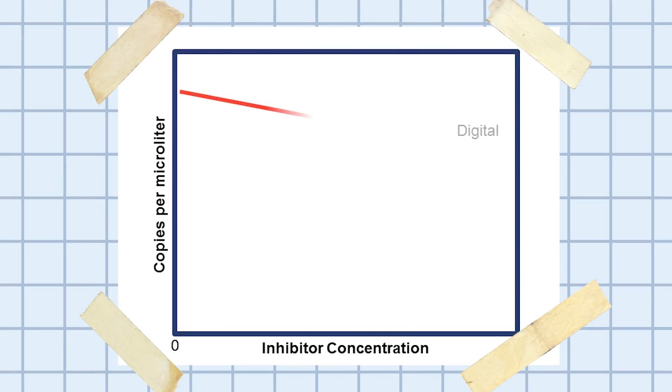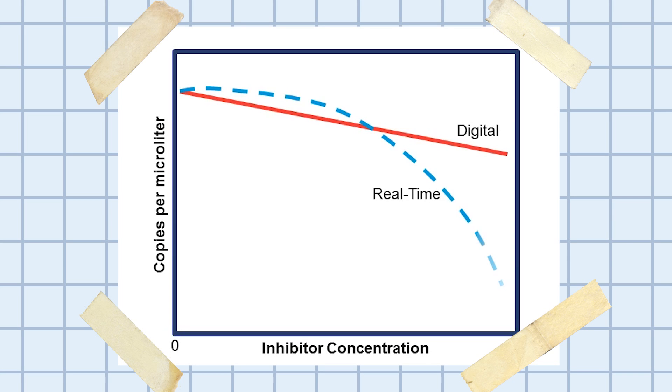Digital PCR is highly tolerant to PCR inhibitors by virtue of the massive partitioning we just discussed. These data illustrate how digital PCR is robust in the face of increasing inhibitor concentrations, whereas the performance with real-time PCR dramatically drops off at high inhibitor concentrations.